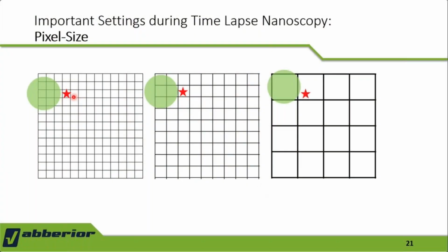But what will happen if we have a very, very small pixel size? So that is a fluorophore, and each area here is 1 pixel. And STED is the same as confocal. It is a scanning microscopy technique, which means that we start from the very upper left and go to the lower right pixel by scanning our region of interest.